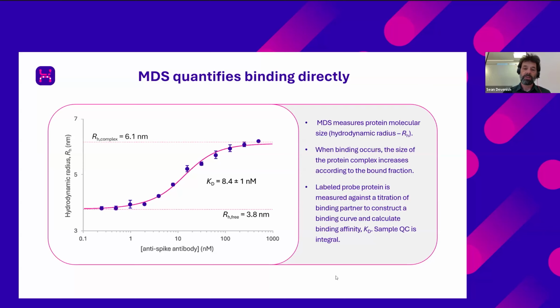We can also ask the question whether this size is consistent with what we expect for the antigen we're working with. So we have some nice tools on our website to predict the hydrodynamic radius of a molecule based on either the molecular weight or the structure. And so we can compare that against what we measure and see if there's any significant disparity there.